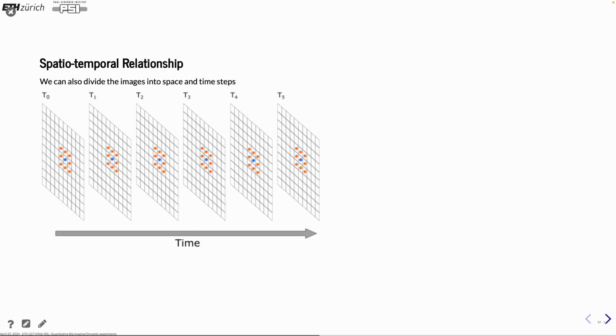The last one is actually doing both. So in principle, this is a 3-dimensional filter of a 2D series. On one side, we have the spatial averaging, and on top of it, we also put the averaging along the timeline. And it's often needed because you have this noisy data, and you really want to get it in a better shape for your analysis.